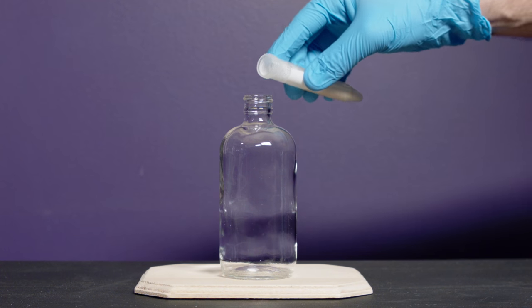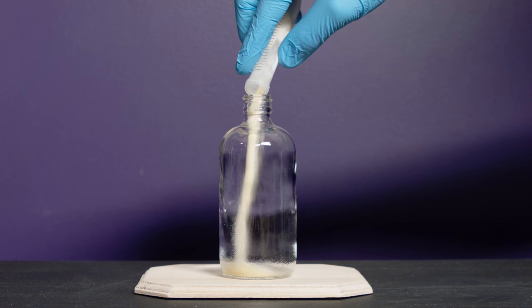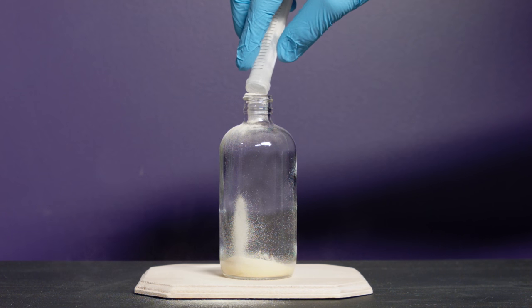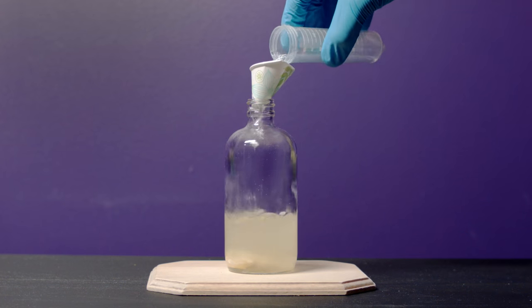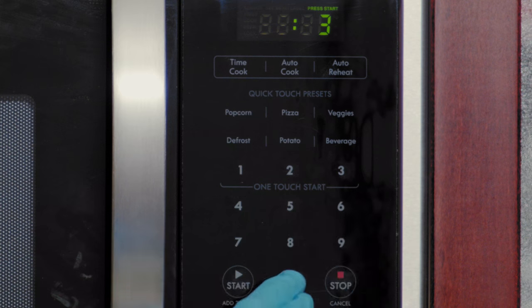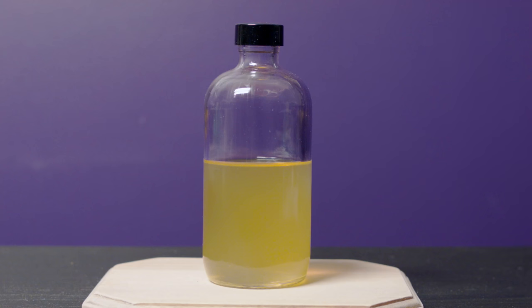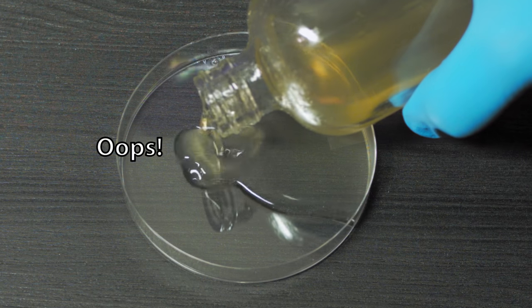Agar is like jello, so is the process of making agar plates. Dump each tube of powdered agar into the glass bottle provided. Some sort of funnel is helpful. Pour in 150ml of water, a half turn of the cap, and then microwave at 30-second intervals for a couple of minutes so the agar doesn't boil over. Once all the agar has dissolved and it's cooled down a bit but still warm, it's time to make plates. But don't let it cool down too much or you'll get clumps.